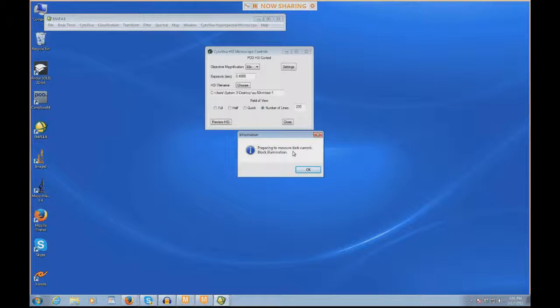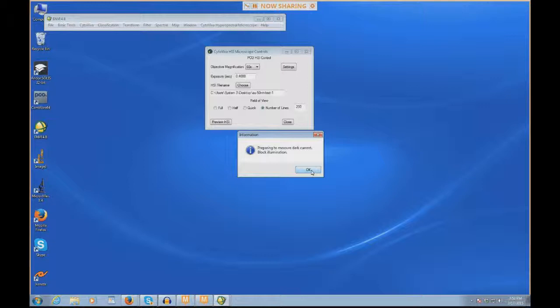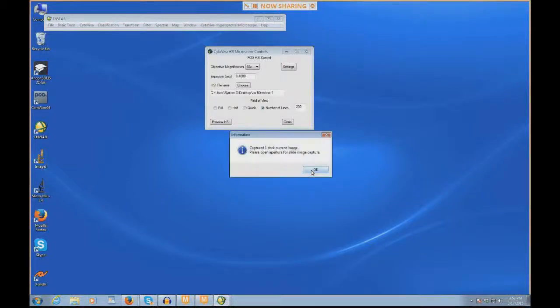When I do this, it says preparing to measure dark current, block the illumination. What this means is the spectrograph and camera combination want to measure what is dark in the microscope. If you feed it no light whatsoever, what is that as a baseline? Then it's going to subtract that from the image. It's like background subtraction. I'm going to do this by pushing in the slide bar in the trinocular piece of the microscope all the way in. When I do this, all of the light is blocked to the camera port. It's going to take one dark current image from this, and then it's going to use this to automatically subtract from the scan. So I'm going to hit OK.